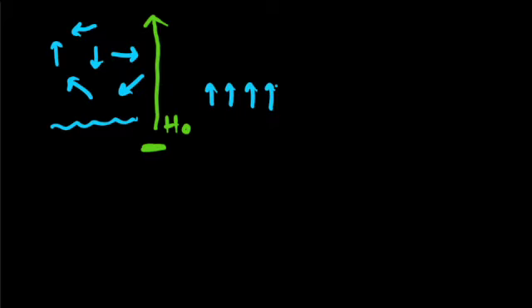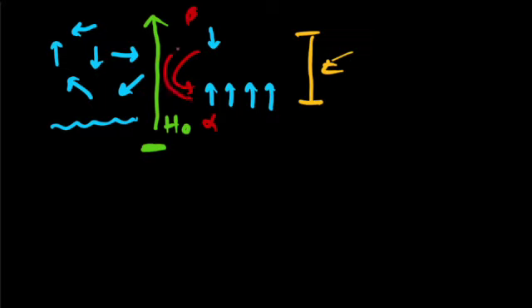Now, if we want, we can take one of those little tiny hydrogen magnets and grab a hold of it and flip it upside down and flip it over. And then it wants to flip back as quickly as it can back to where it started. So we call these the alpha spins when they align with the magnet, and we call them beta spin when they don't align with the magnet, when they're opposite. But we can take one of those, we can flip it over, and that takes a certain amount of energy, the difference between alpha spin and beta spin, and we can turn it into the beta spin, and then it would relax right back down to the alpha spin.